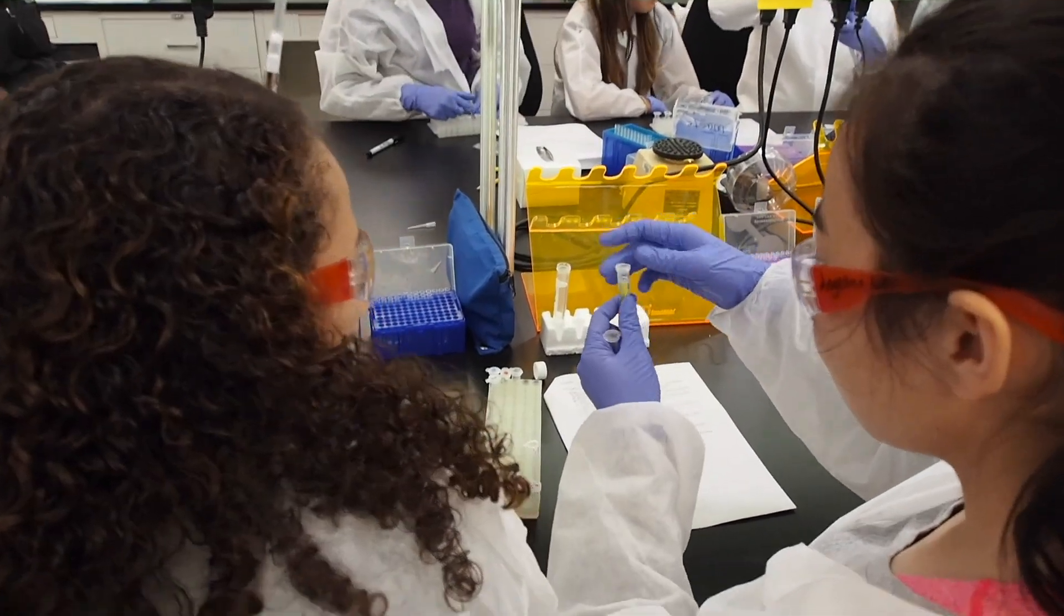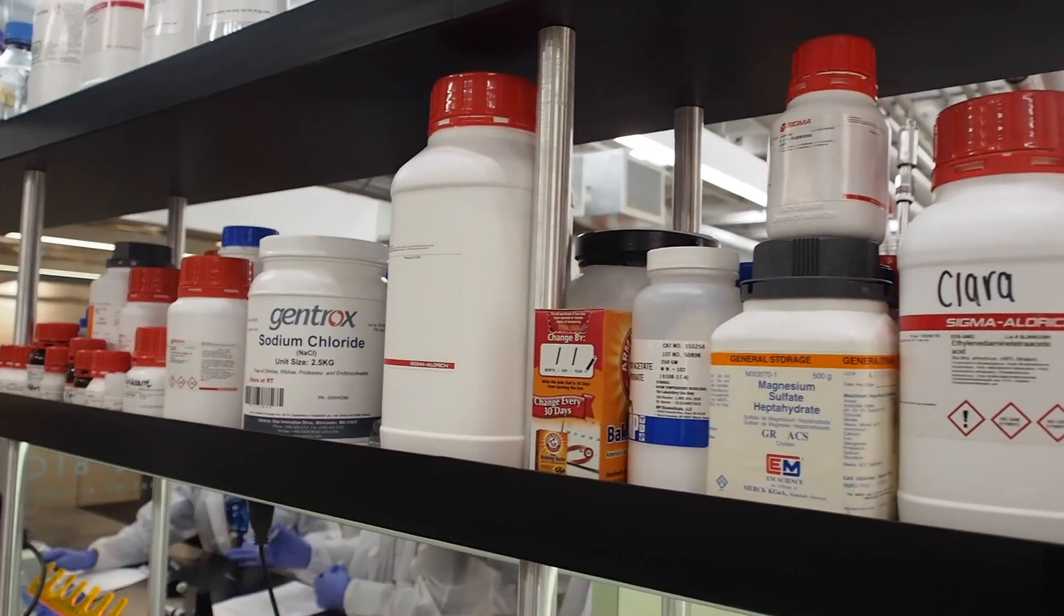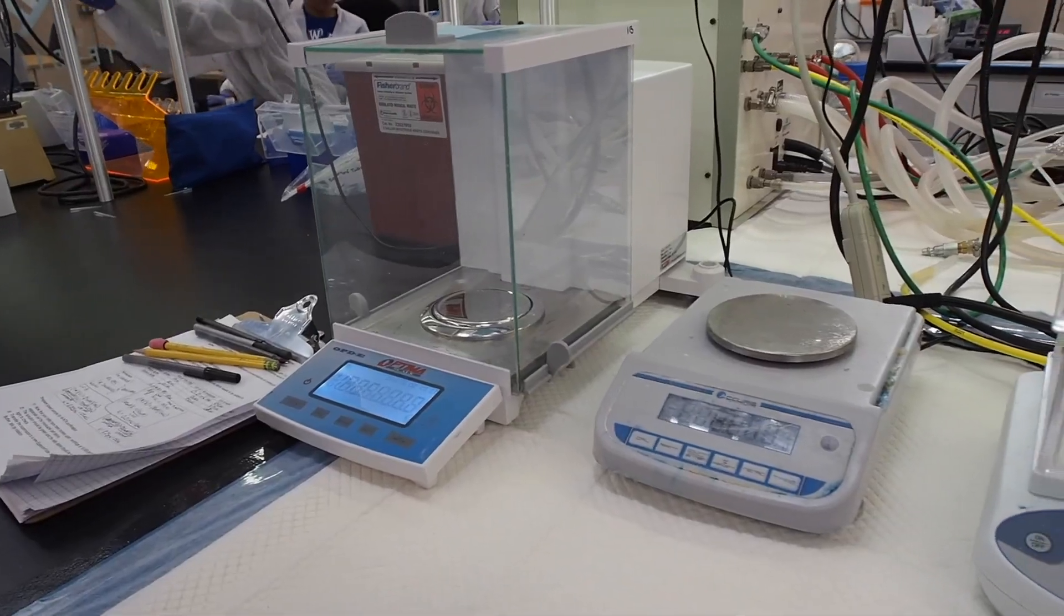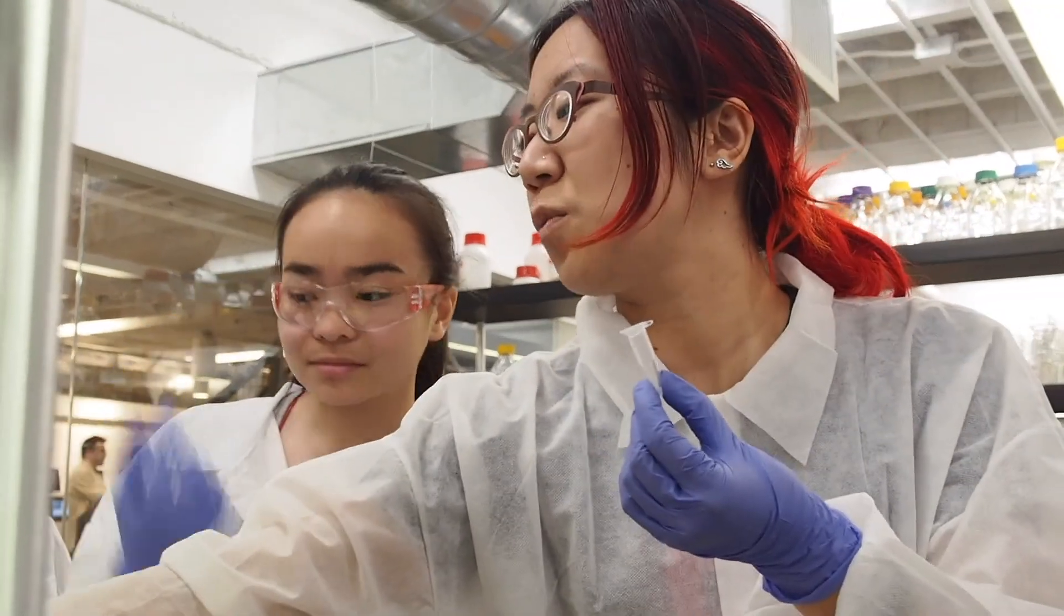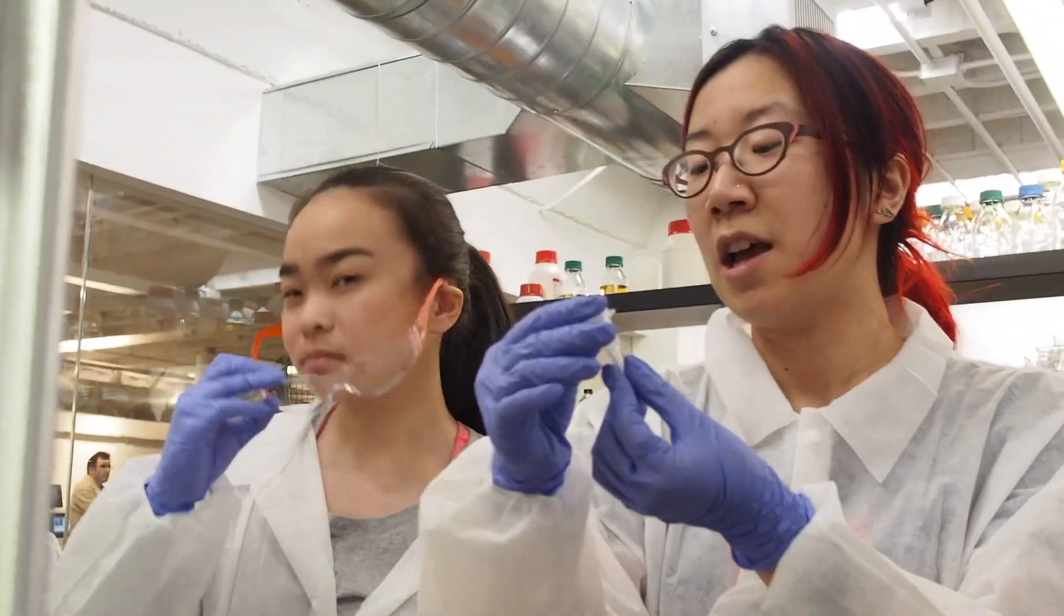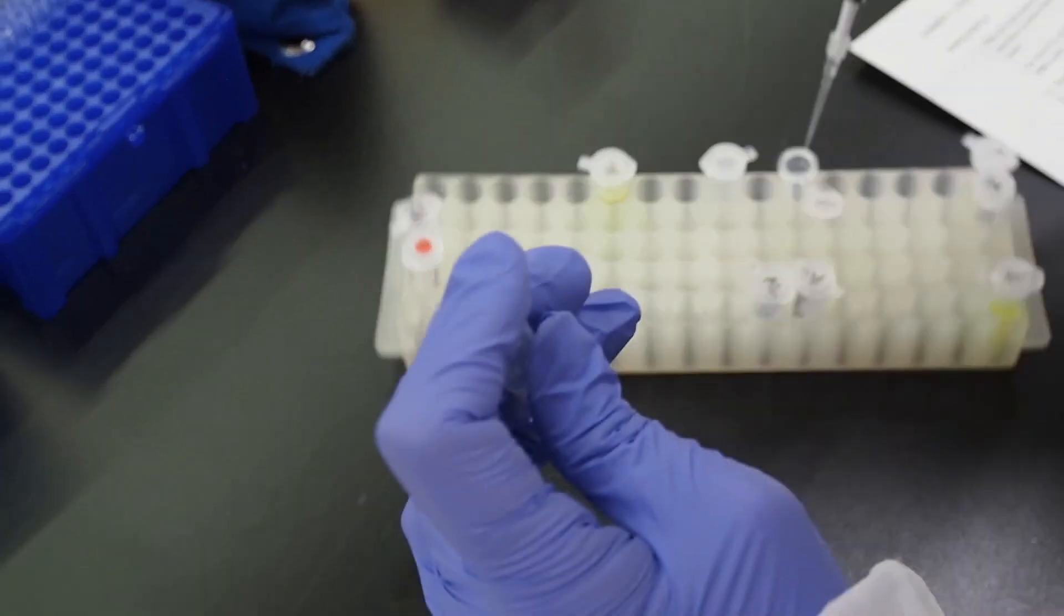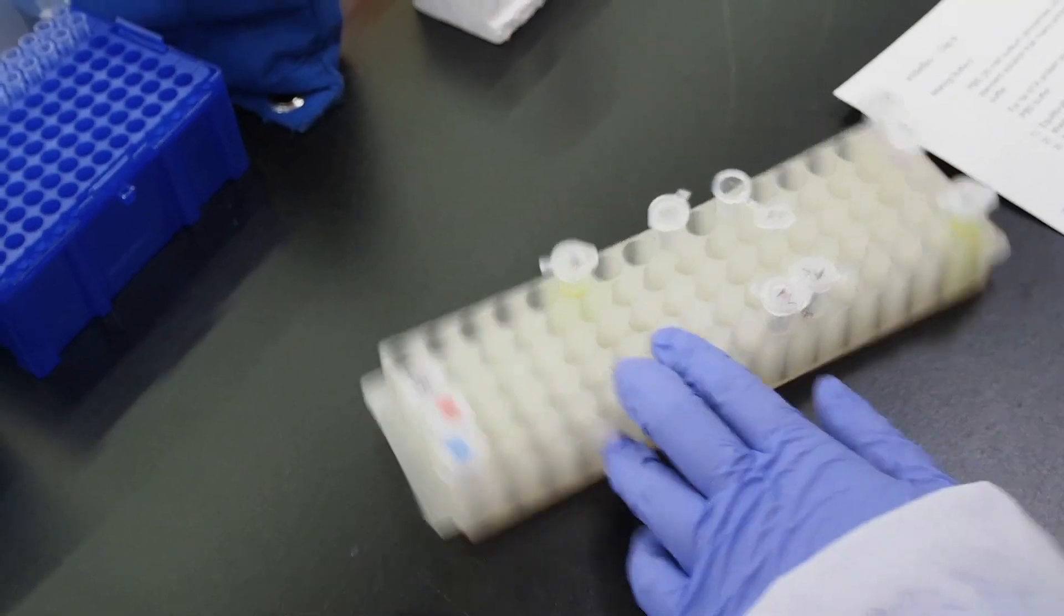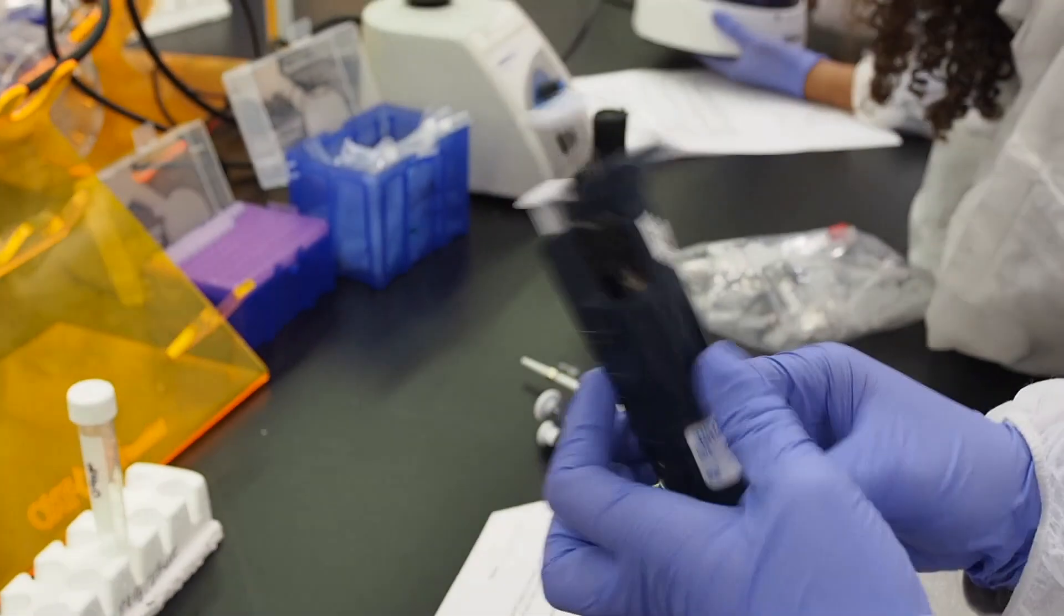We learned how to use green fluorescent protein, which is found in jellyfish and allows the jellyfish to glow. We were able to use the green fluorescent protein and a process called molecular cloning to make E. coli, a bacteria, create the green fluorescent protein.